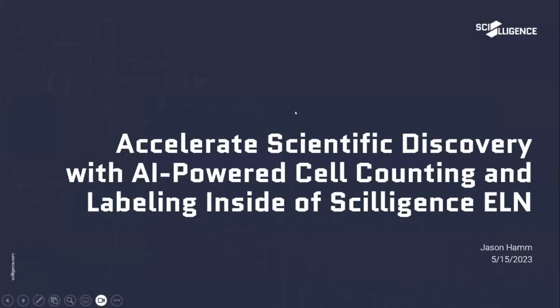I'm going to be shifting gears for the talk, away from chemistry for a second to biology. As you may know, my name's Jason. I'm excited to talk about some of the new AI stuff Scilligence is working on. I've been working with one of my colleagues, Ray, on this really cool tool for ELN.